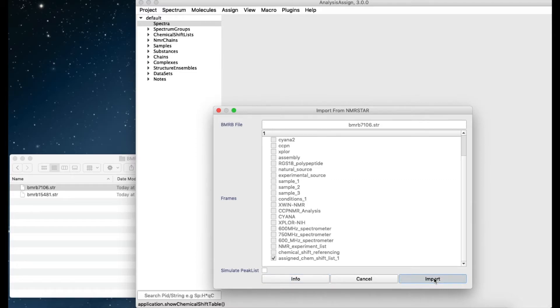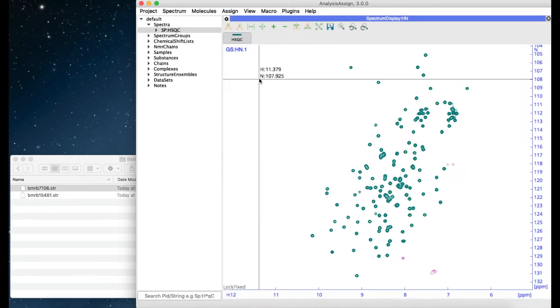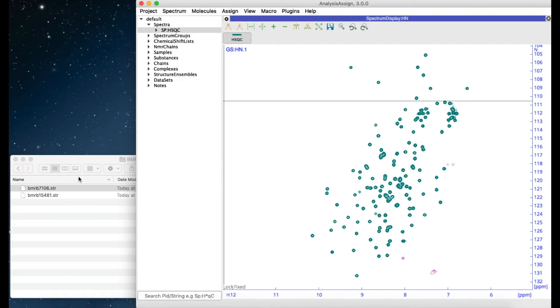For larger files you may find that this takes a minute for all the NMR atoms and Chemical Shifts to load. If you want to create a HSQC peak list directly from your Chemical Shift in the BMRB file, you can do this during import.